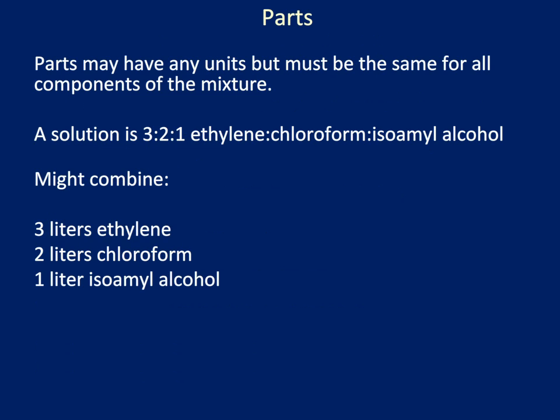Parts are sometimes used as concentration expressions. They are usually reported in ratios, such that a part would be 3 to 2 to 1. It is better to be clear what that ratio is, a molar ratio or a volume ratio, but for certain, all of the units for each of the numbers must be the same.